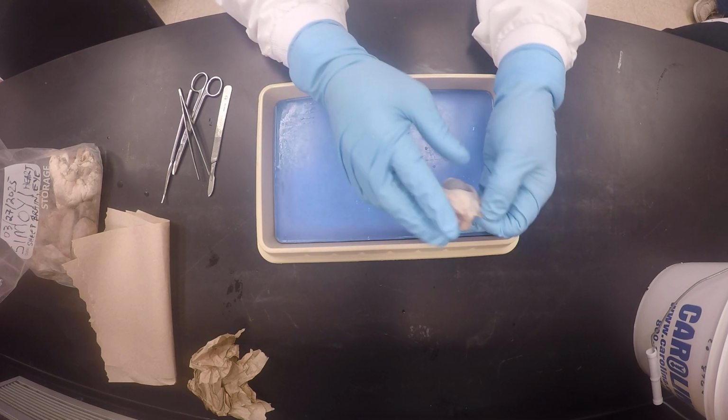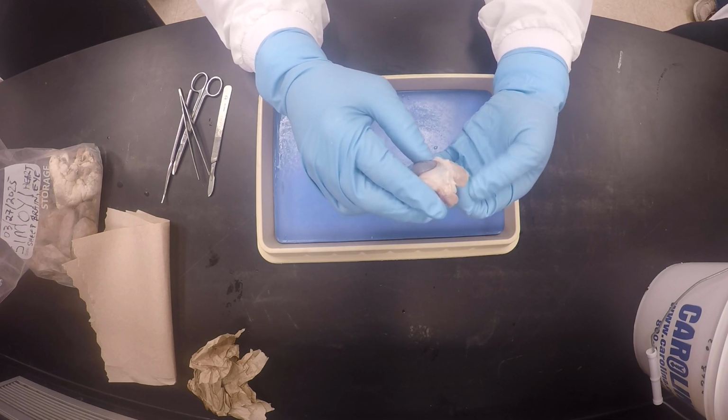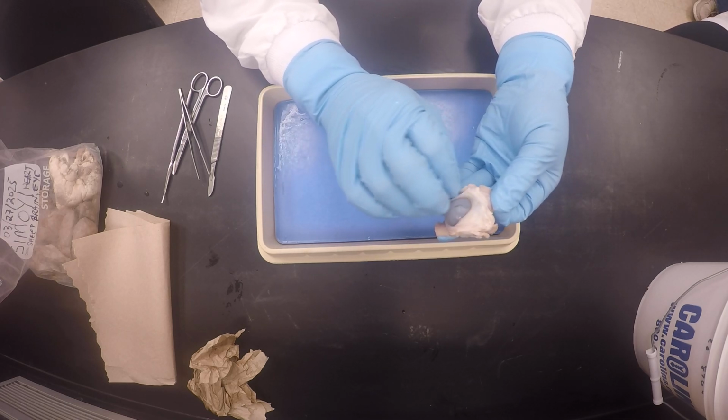It's clearly got one muscle, and this one is the very busy one, so this will be the lateral one, and it does have a lateral rectus here, and it does have the inferior oblique here.